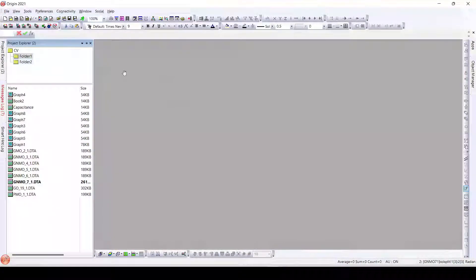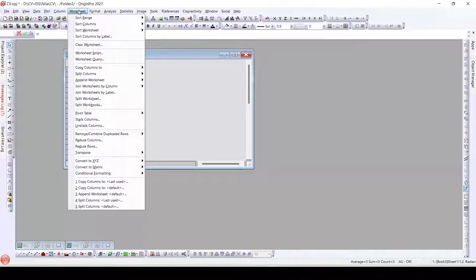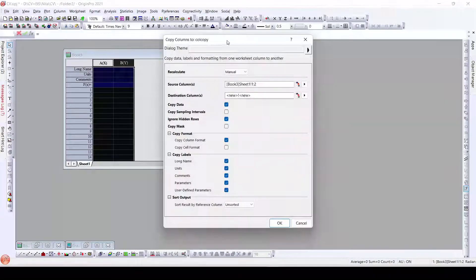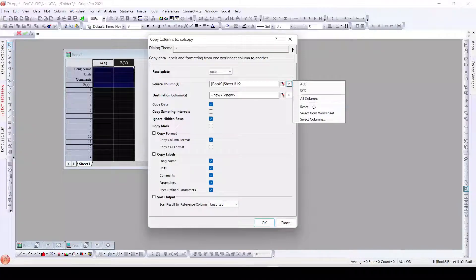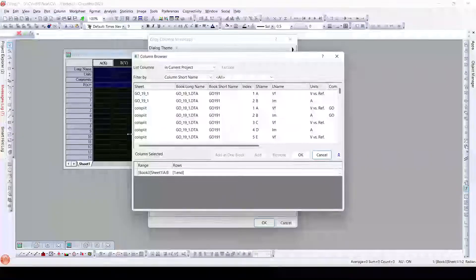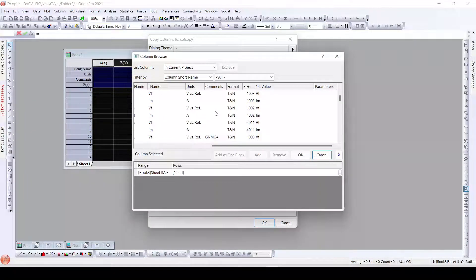So here what we will do is we will go to worksheets and select this. We will go to Worksheet and here click Copy Columns To. Using this function, the dialog opens and here we have Recalculate — we will set it to Auto. Source columns — we will select the source columns. As we can see, we will select columns here. For convenience, I added comments, and we can see there are comments to the worksheets that we need.